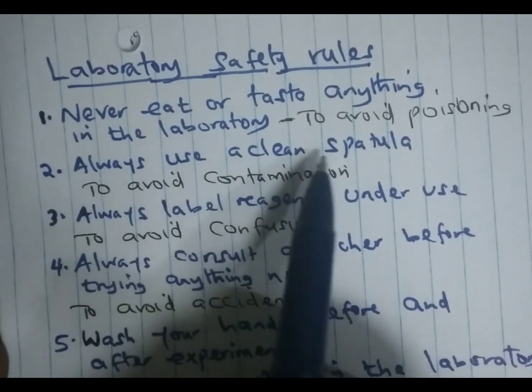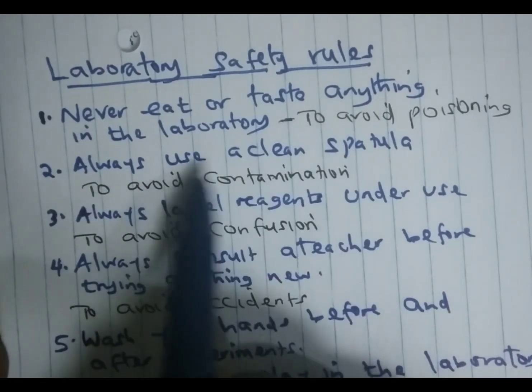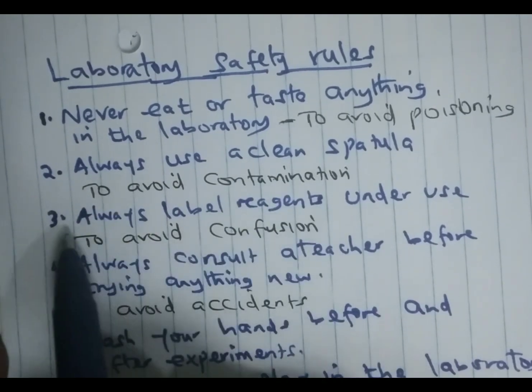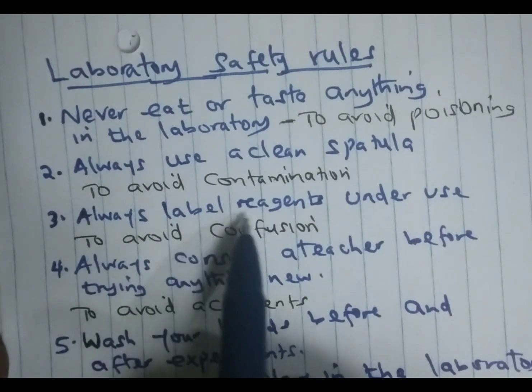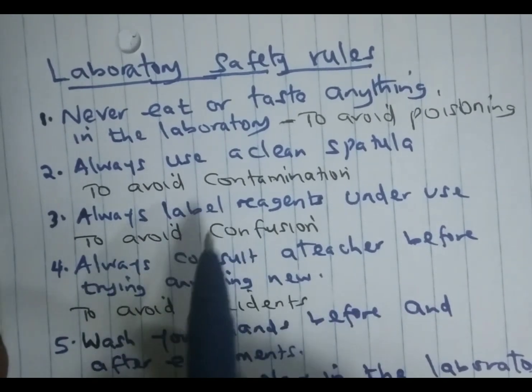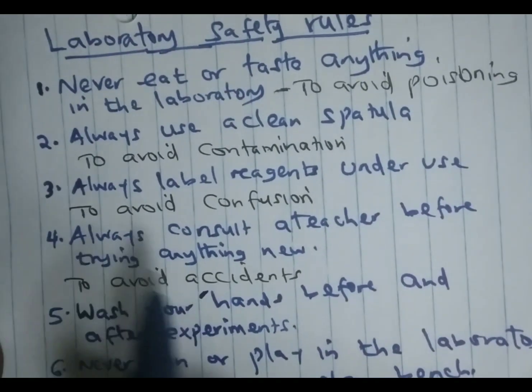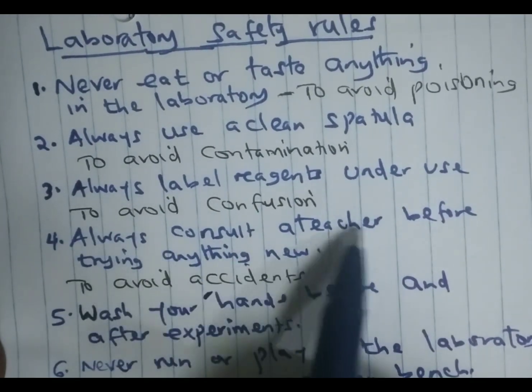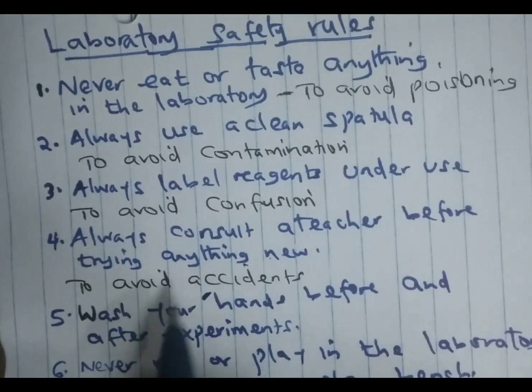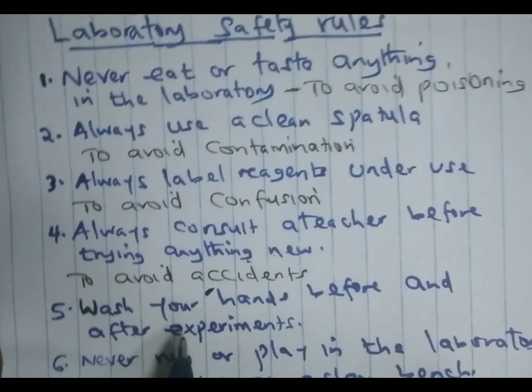Two, always use a clean spatula, and the reason why we use a clean spatula is to avoid contamination. Three, always label reagents under use, and the reason for that is to avoid confusion. Four, always consult a teacher before trying any new experiment, and the reason for that is to avoid accidents in the laboratory.